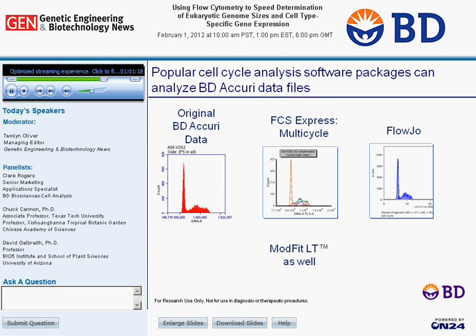Lastly, I just want to mention in terms of cell cycle analysis algorithms, there are a wide variety of algorithms out there, and I am not expert enough to recommend which one to use, but I can say that our BD Accuri FCS files created in our software can be exported and analyzed in multiple third-party software analysis programs. So on the left in this plot, you can see an example of some Accuri data as it appeared on the C6 system. This was a cell line stained with propidium iodide, and it had a fairly decently high S-phase population. You can see that's the bump in the middle there between the far left high peak and the right-hand third peak. And this data was run through FCS Express using multi-cycle.